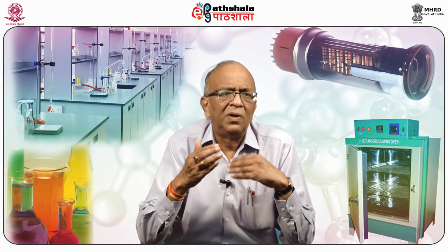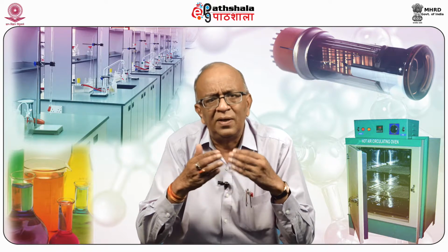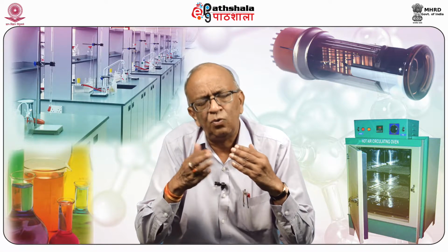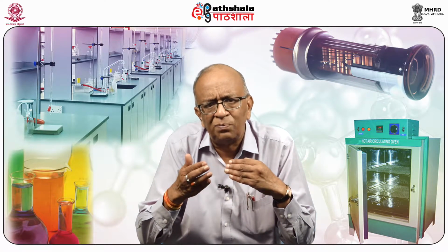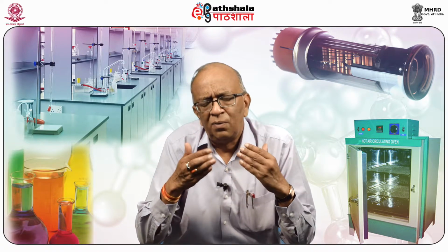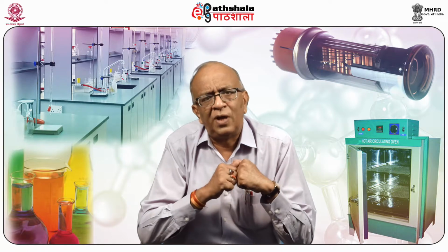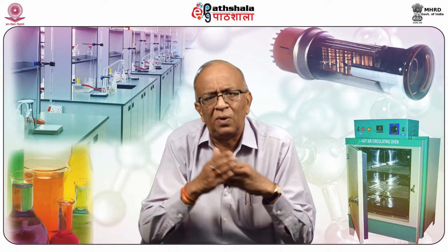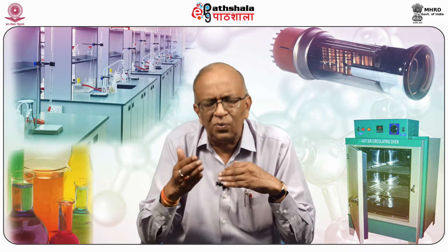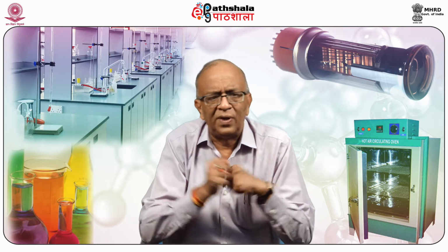Here again, we will note the change in mass with the temperature, and the instrument is again a thermobalance, which we will utilize for taking the weight of the substance. A plot will be drawn here, as in the earlier case where the plot was mass versus temperature or time. Here it is the differential of mass which we will take versus temperature.